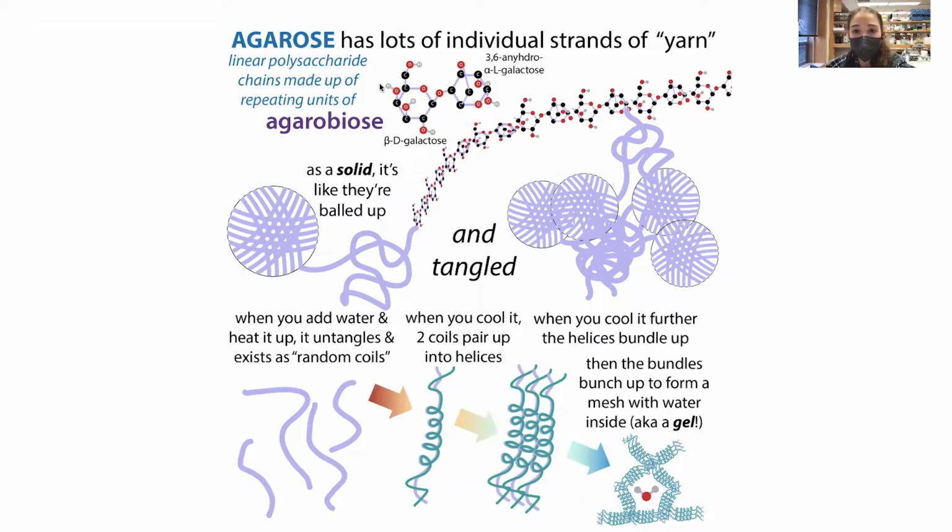So when you have just a container of solid agarose, you have these long chains. Typically they're about 400 disaccharides, or 800 monosaccharides, in these chains. And when you have it in its solid form, it's just like a solid. But when you add buffer, so when you add your TAE, your Tris-acetate-EDTA, basically when you add liquid, what's going to happen?